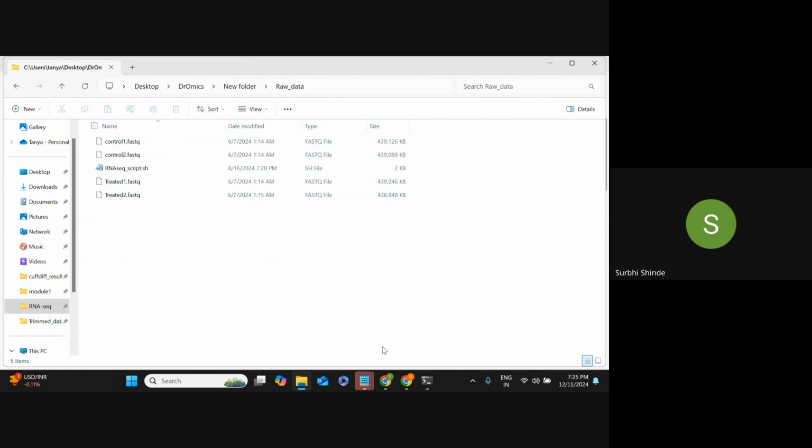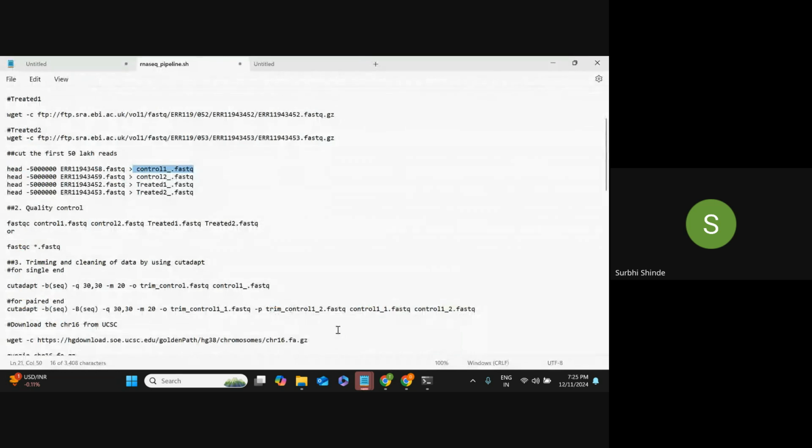Ma'am, can you please tell me which of these steps I have to do in Anaconda and not in the other app? Just wait for the Anaconda. The Windows user also, you have to perform from these steps.